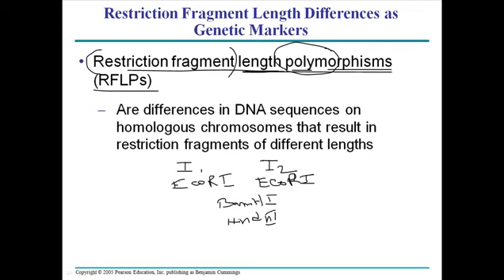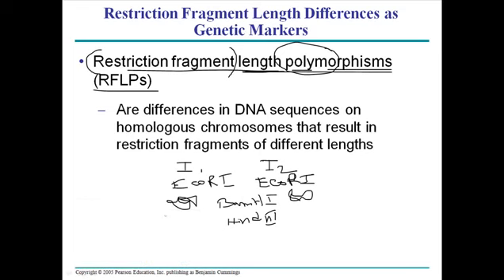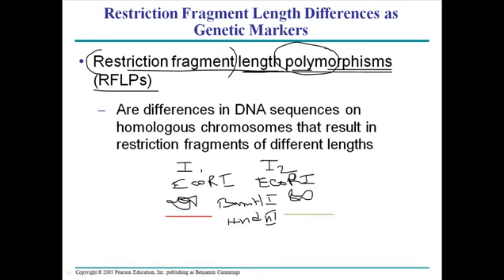We take the exact same amount of the DNA. This is their long DNA in both cases, and let me change the color. For these I make the DNA straight away like that, and for this I make it another color, this green color, which is my favorite again. So we have two different individuals. We use the same restriction enzyme to cut them.